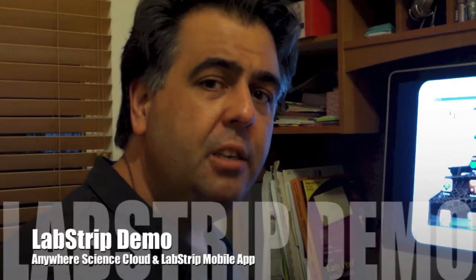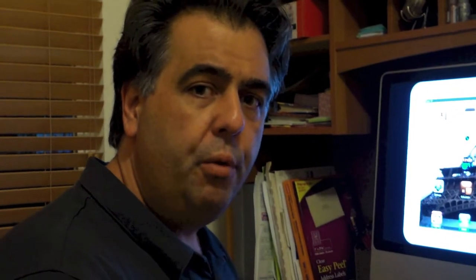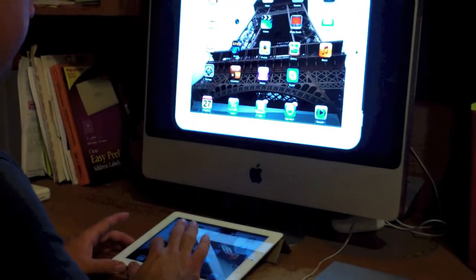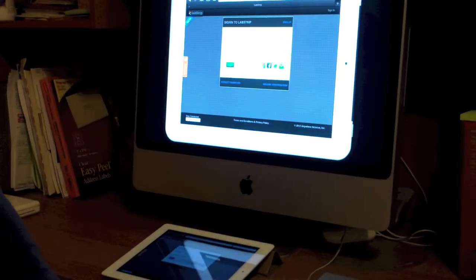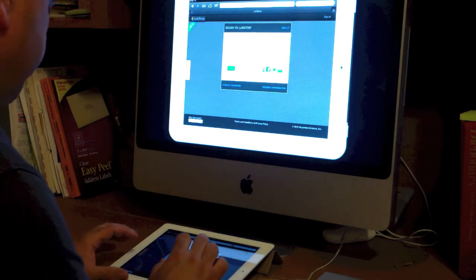Hi, Brian here. I'd like to do a demonstration of how LabStrip and Anywhere Science Cloud work together through our website and our mobile application. So I'm going to do this with my iPad. I'm going to record this using a mirroring application so that you can see what I'm doing a lot more clearly.